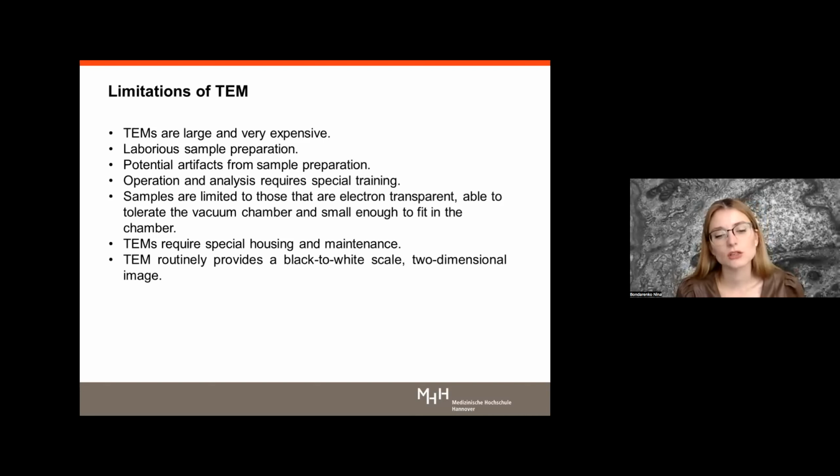What else? Potential artifacts from sample preparation. So we use fixation and, let's say, dead material, so it's not in vivo examination, and certainly it leads to different artificial changes of the sample. Operation and analysis requires special training. Yes, sure. And it's not so easy to work with this device, with this microscope.